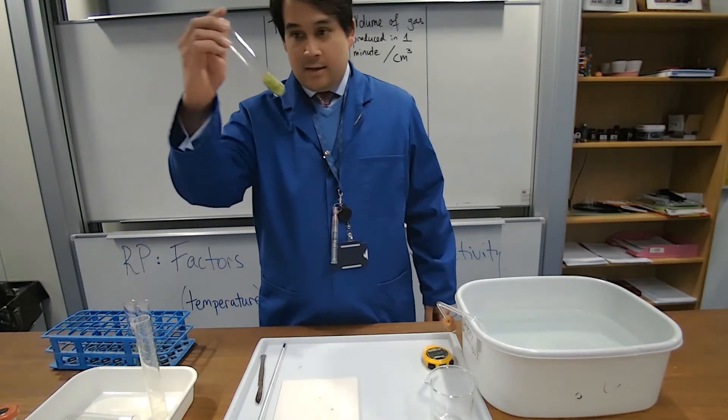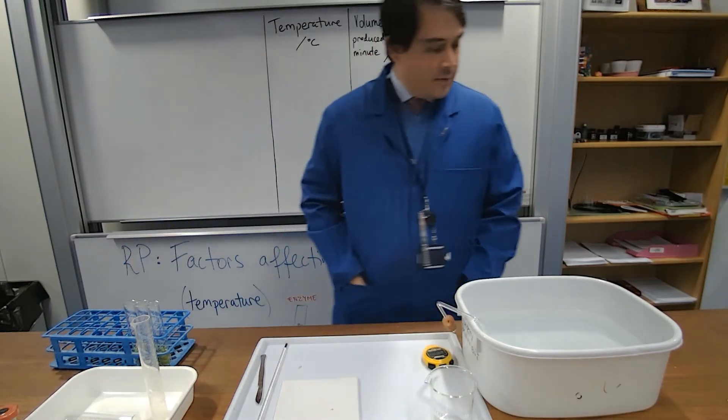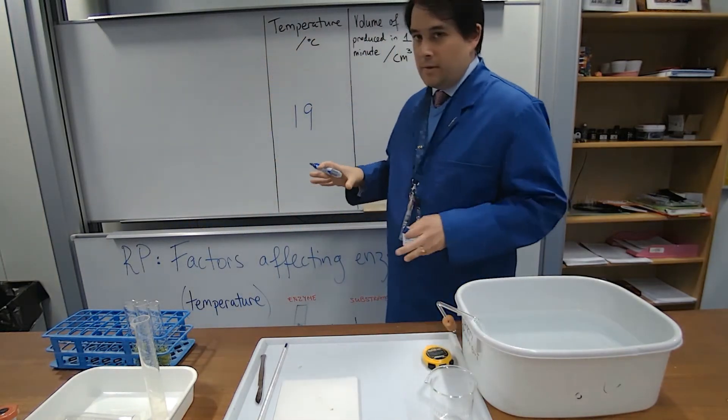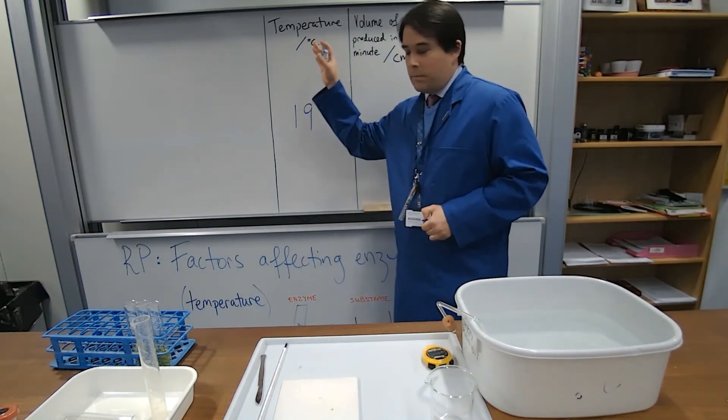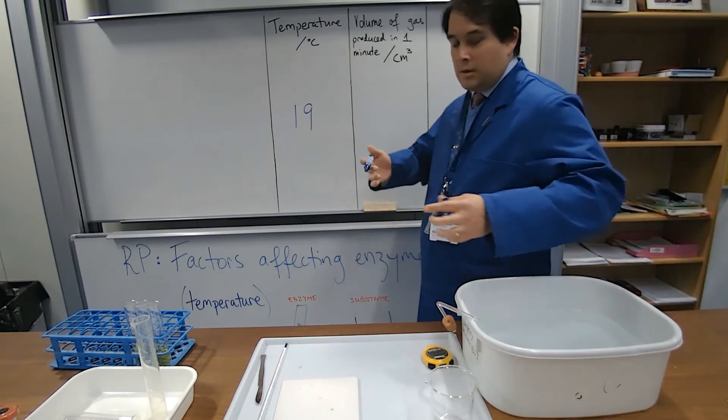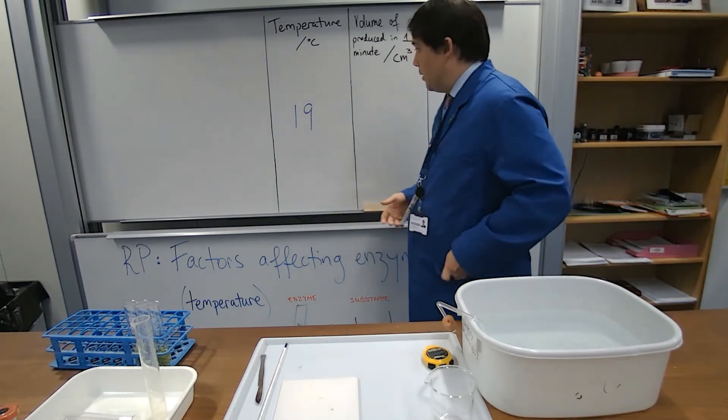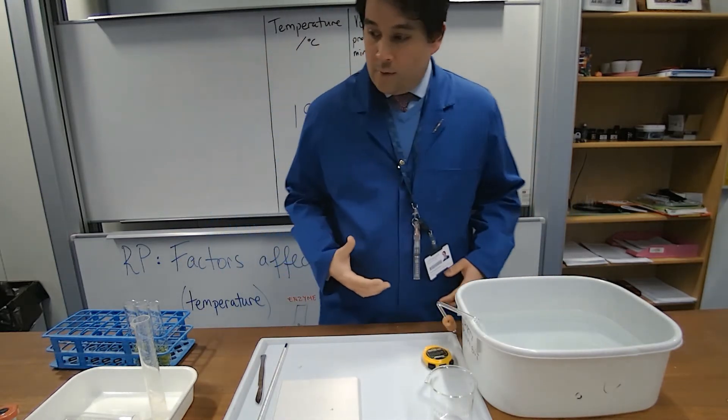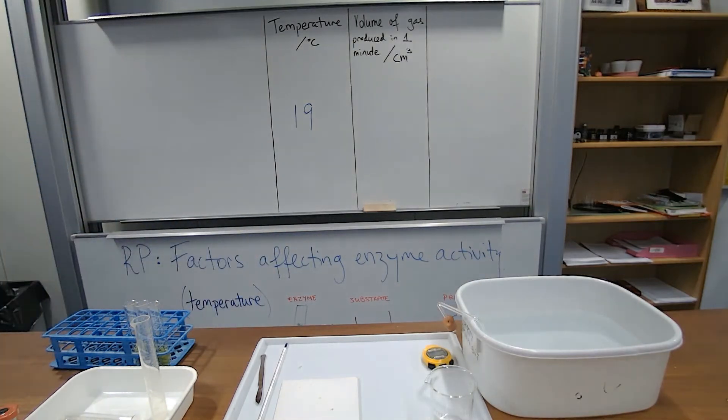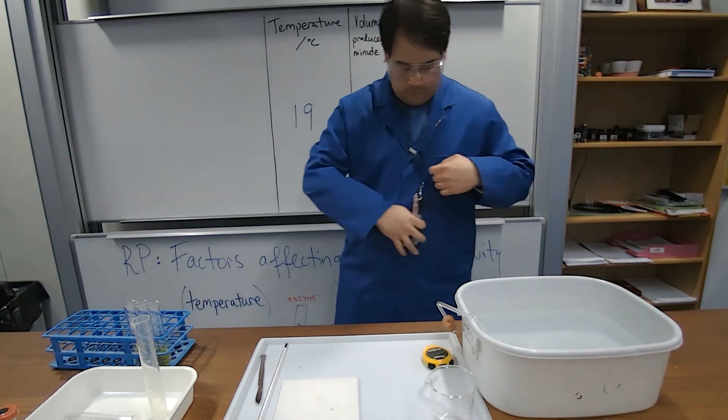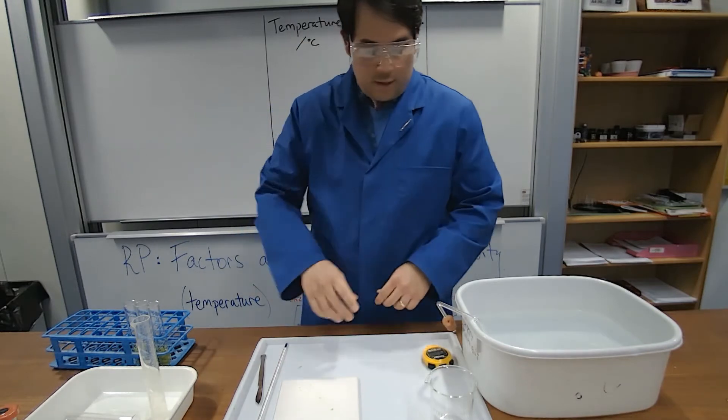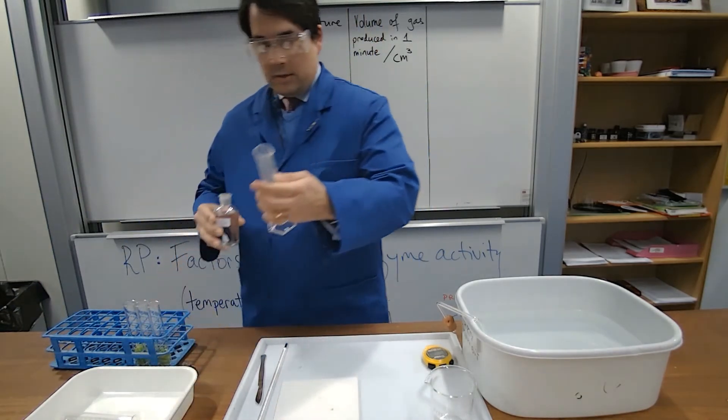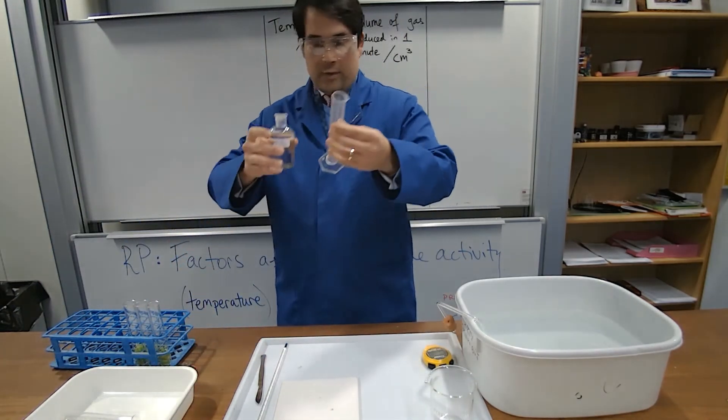Right. So, this is at room temperature and that is at 19 degrees Celsius. So, I'm going to put 19 there. Perfectionists would do the colder one first and along the lines, but you know, for the purposes of video, I'm going to speed this along a bit. So, at 19 degrees, room temperature, I'm going to use the same volume of hydrogen peroxide the whole way through, equal volumes just to make sure that that's a controlled variable. I'm going to use 20 milliliters.